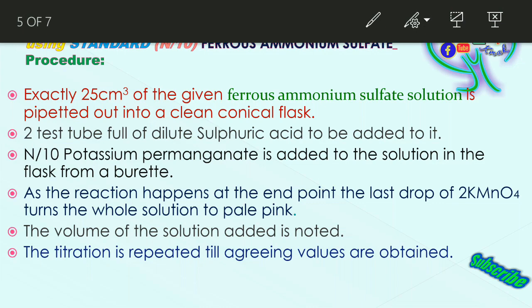Run down potassium permanganate from the burette drop by drop to titrate the ferrous ammonium sulphate already taken in the conical flask. As the reaction proceeds, at the endpoint the last drop of KMnO₄ from the burette turns the whole solution to a pale pink color within the conical flask, indicating that the reactants have neutralized each other.